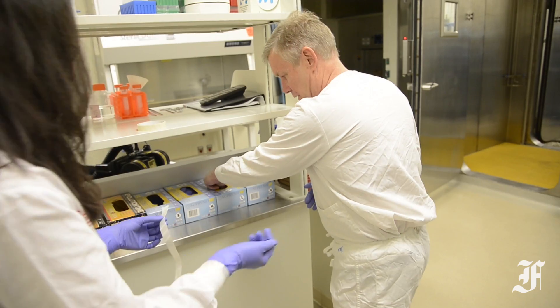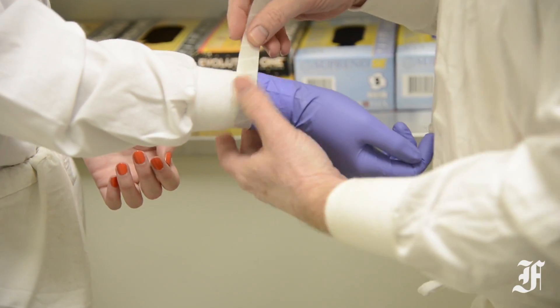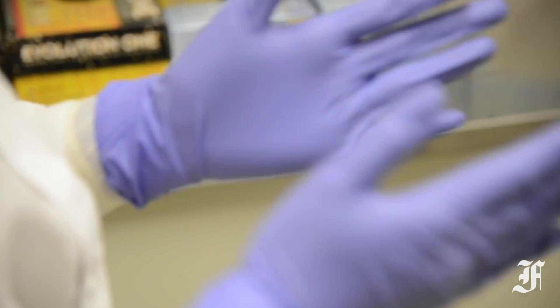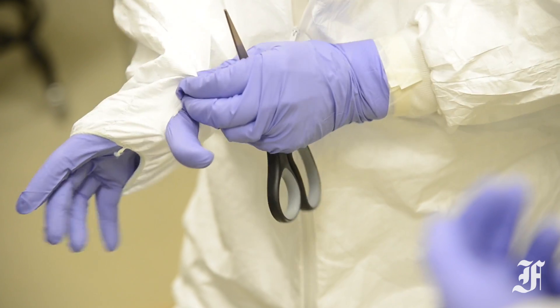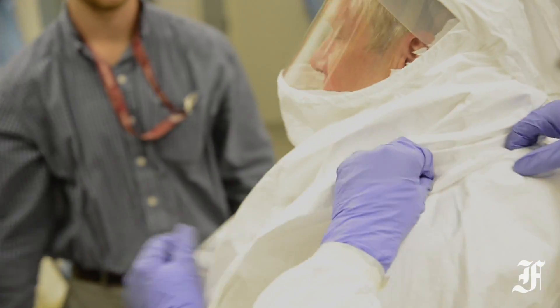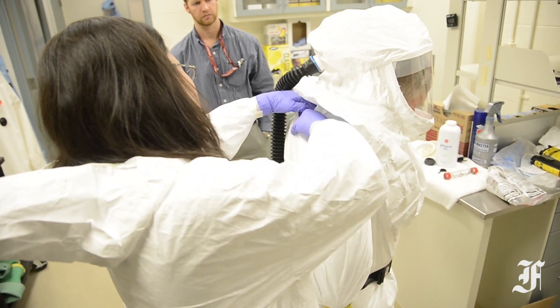Multiple layers of gloves and strips of adhesive tape used to create a seal to workers' Tyvek suit are critical components that ensure no skin is exposed while working with the deadly virus. The donning of personal protective equipment, or PPEs, is always done in a buddy system, with each person verifying that their teammate is safely equipped.